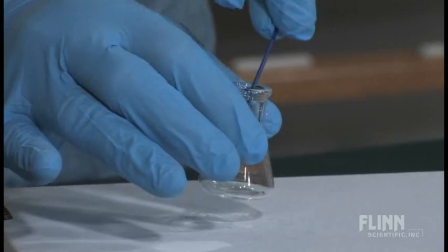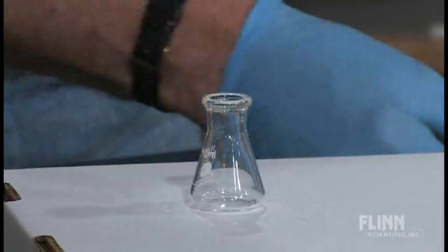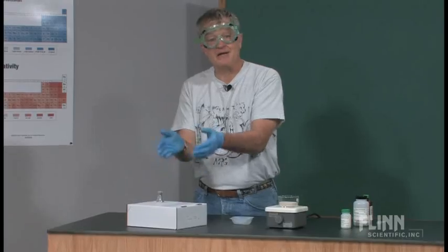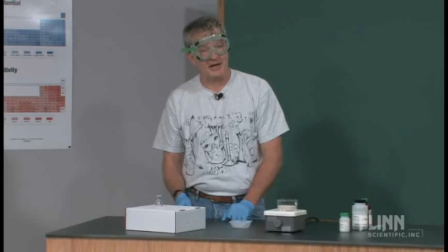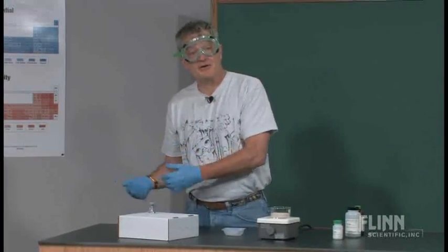I'm simply going to transfer it into this 10-milliliter flask that I have over here and drop it in. So I'm going to dump that in like so. Students would have massed that material ahead of time, so now we would know the mass of manganese that we've placed inside the flask, and that would be one of the pieces of information we would use eventually to calculate the empirical formula.